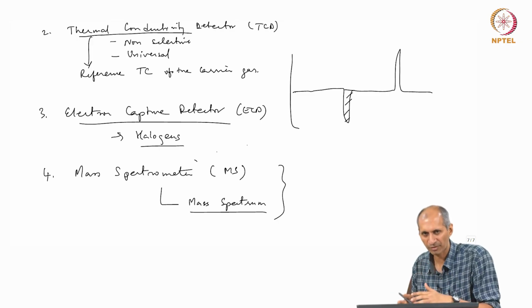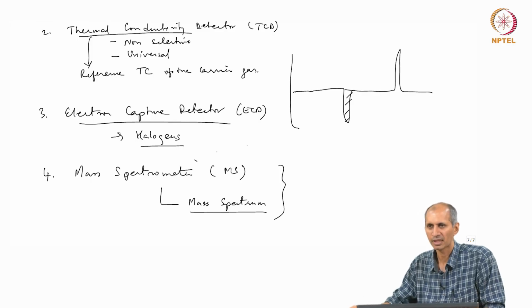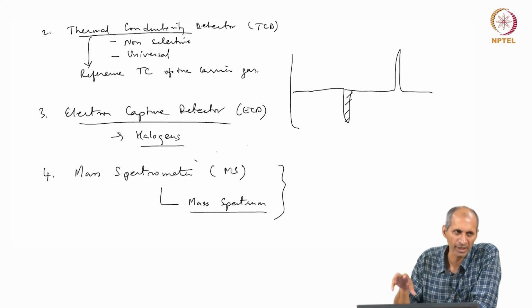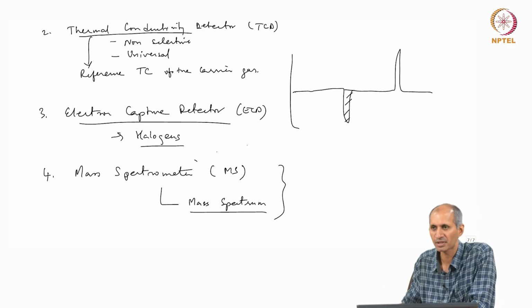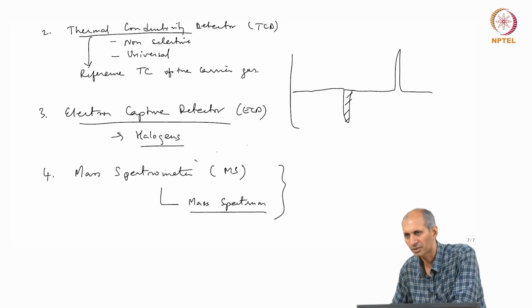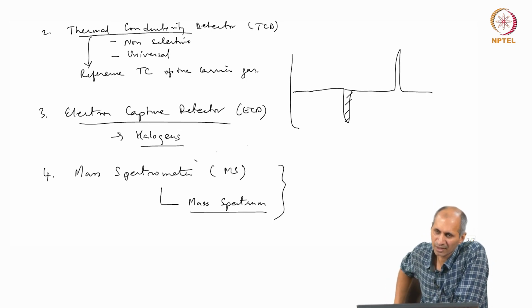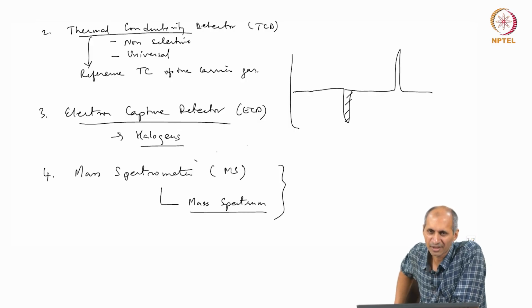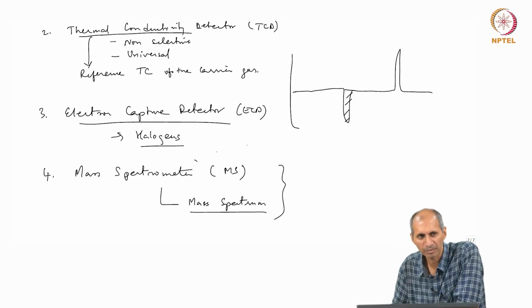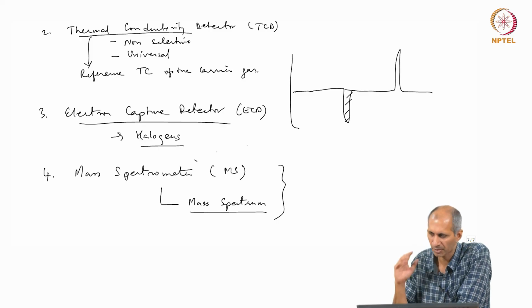You do a pre-chromatographic separation using one of those column chromatography methods, and you take only PAHs, or only oils and alkanes, separated, and then put that into the GC with FID, and the peak will only have that particular fraction. So, then you have a better chance of guessing what the compound is. You have to again be very smart about how standards are used to get the qualitative as well as quantitative information that you want. Okay, we will stop here and pick it up tomorrow.